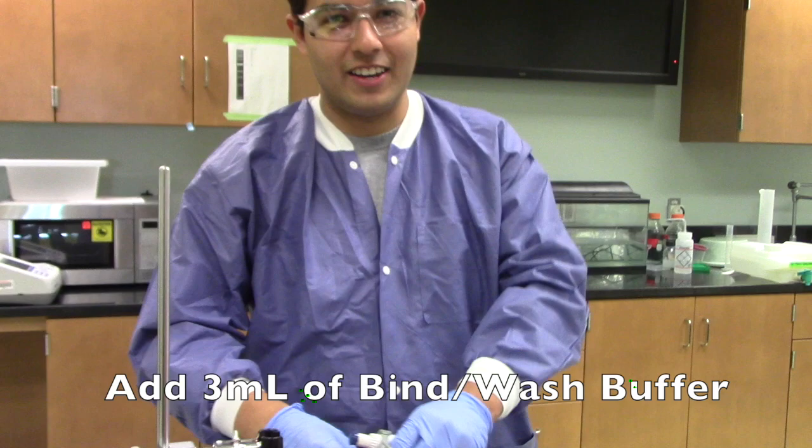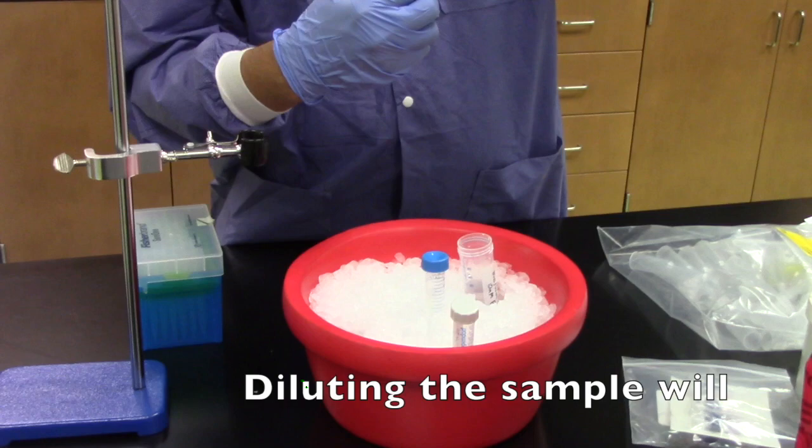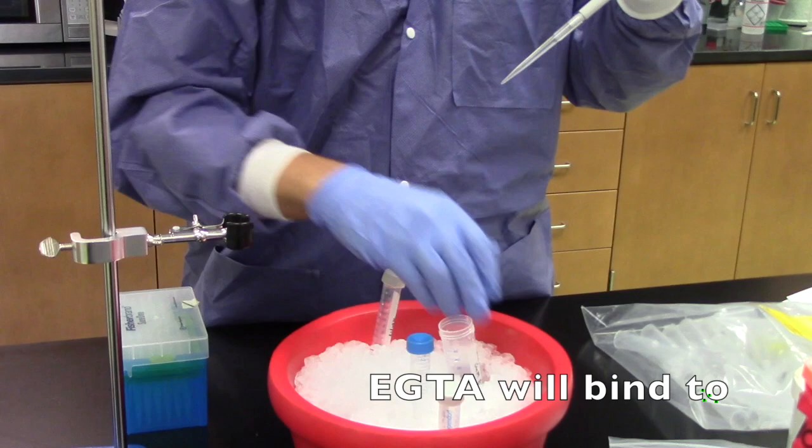Add 3 milliliters of bind wash buffer with 10 millimolar EGTA. Diluting the sample will increase the sample binding to the column. EGTA will bind to any present calcium that could otherwise bind to GST Campari.